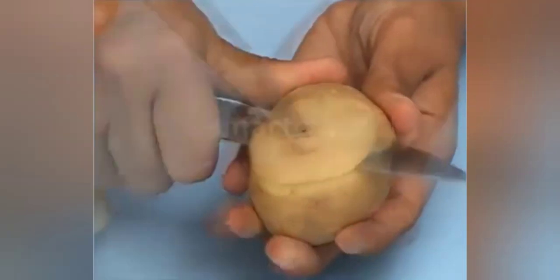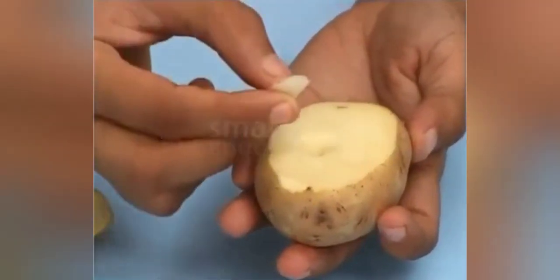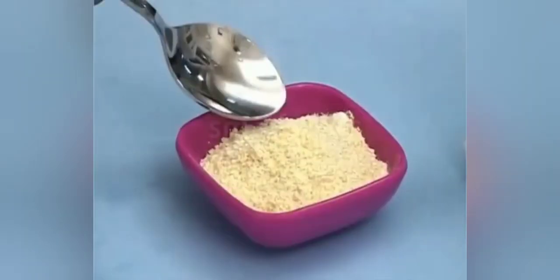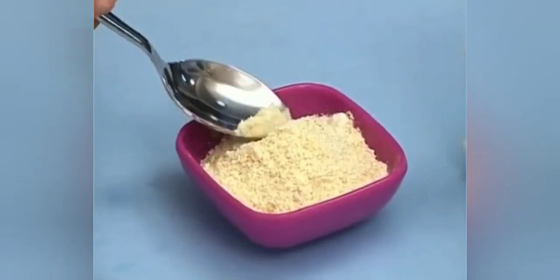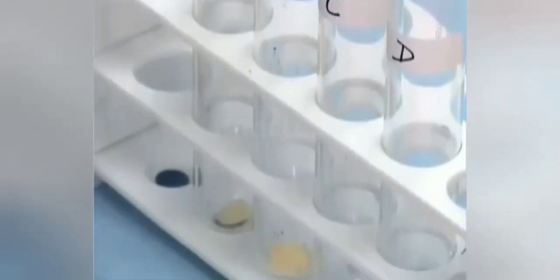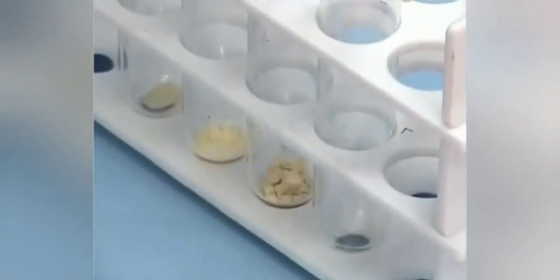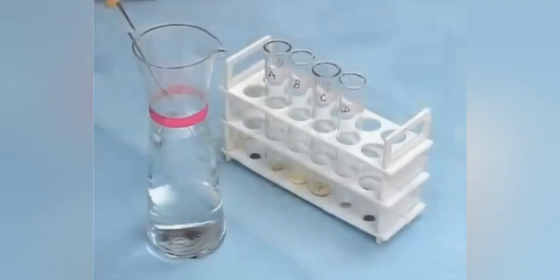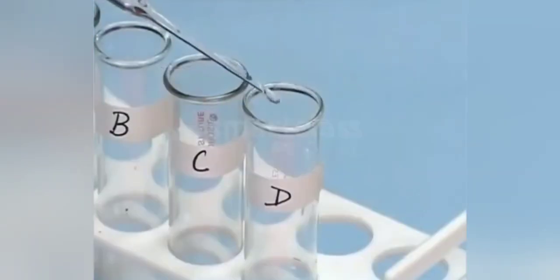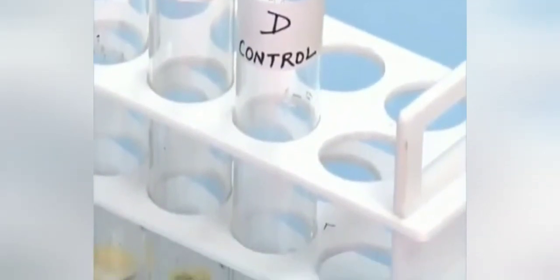Cut a small piece of potato with the knife and put it in the test tube A. Take a little quantity of powdered pulse and put it in the test tube B. In the test tube C, add a few pieces of crushed cashew nuts. In the test tube D, add a little amount of water and label this as control.